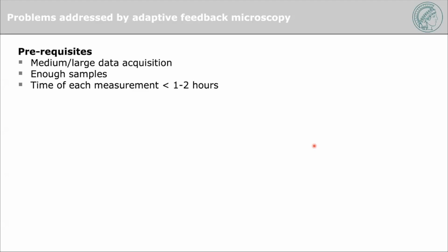So there's no point in having such a feedback microscopy experiment. Ideally, the two goals for this kind of experiment are of course to achieve a high amount of data, but also to best use the instruments. If you can run the instruments day and night, that's the goal, so that for the time they are in use, we really make the best out of them.